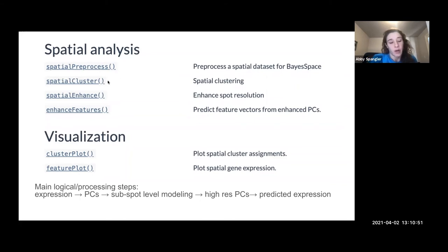And then it'll do clustering on the default is like top 15 PCs. And then it will do the same clustering but at the sub-spot level with the enhanced spatial clustering or spatial enhance function.